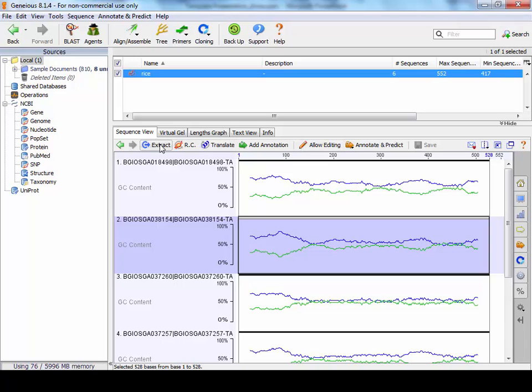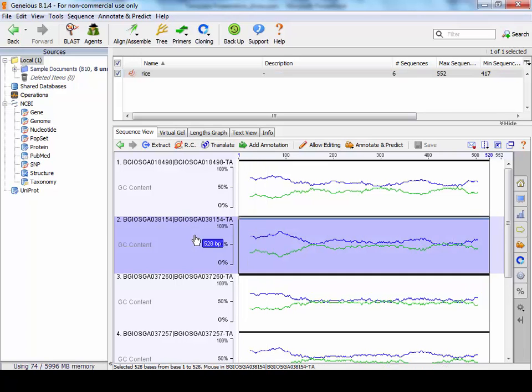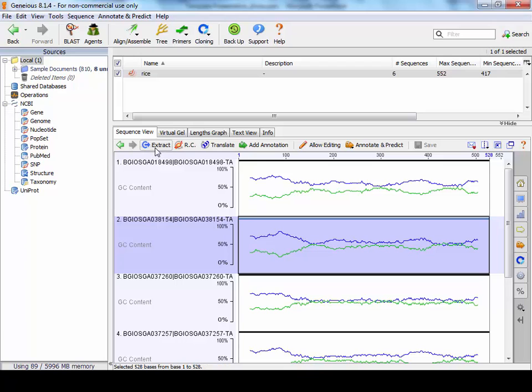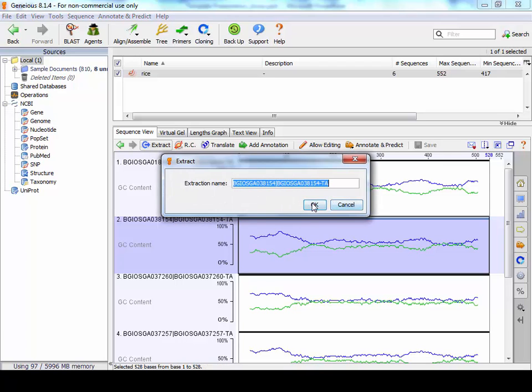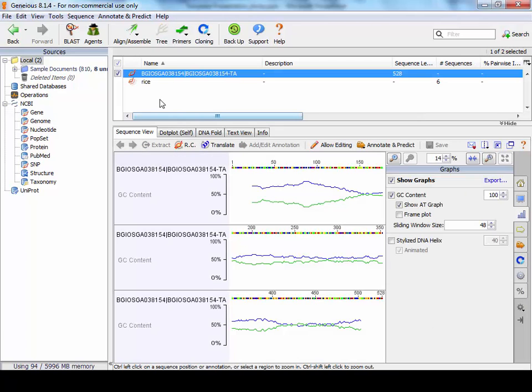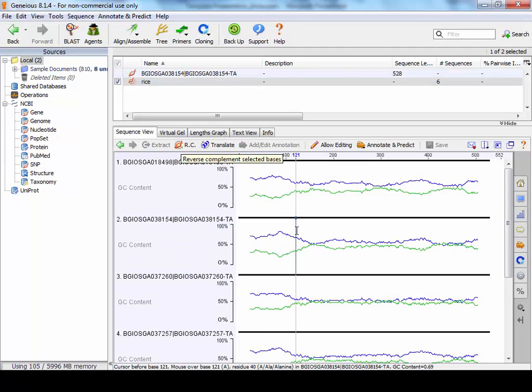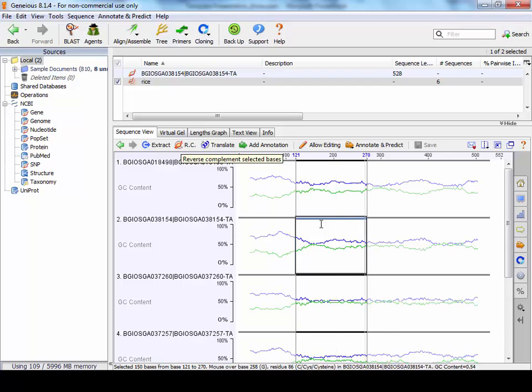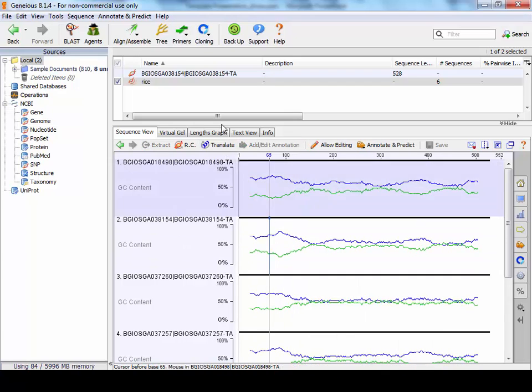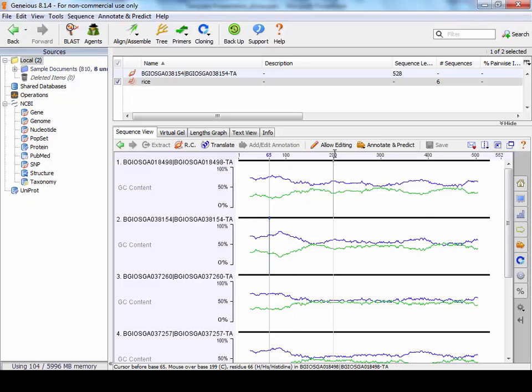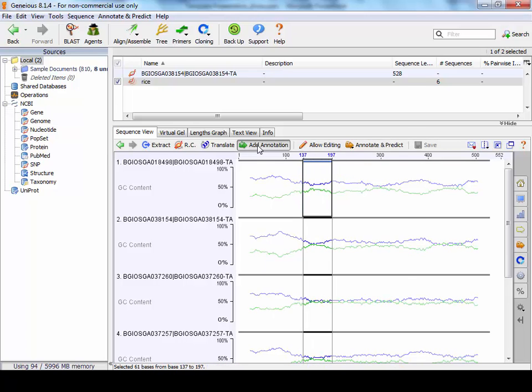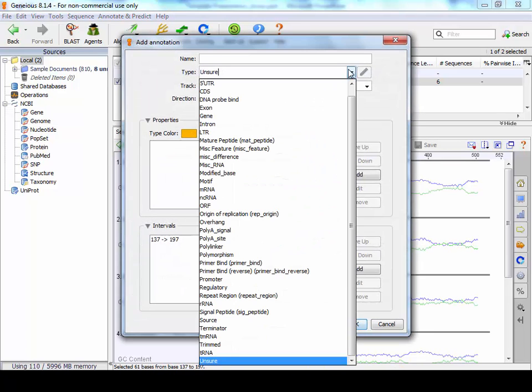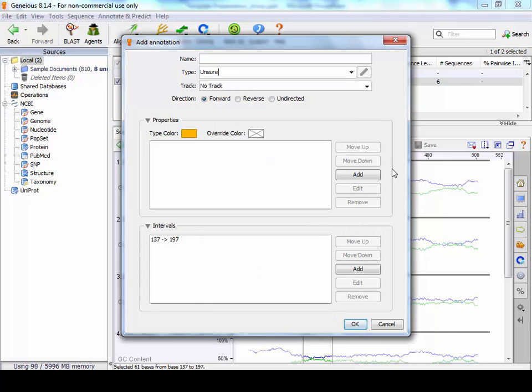So these buttons along here, you can extract a sequence by clicking extract, and this will extract it to another file. You can reverse complement a sequence, highlight, and then just reverse complement that sequence or the whole sequence. You can translate these sequences to proteins. You can allow editing and then change the sequence yourself. You can highlight add annotations. So if you wanted to add a cDNA or a gene annotation, you can do so.